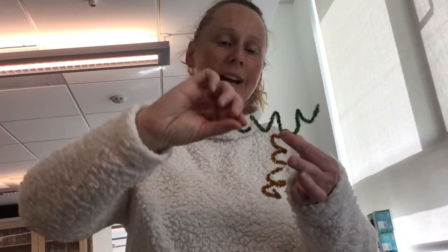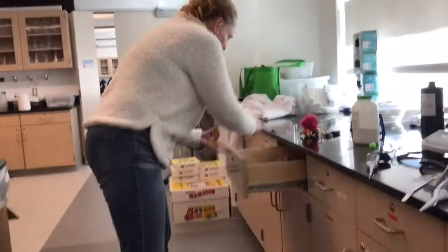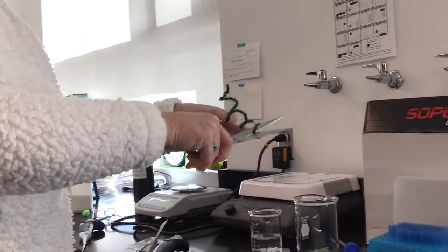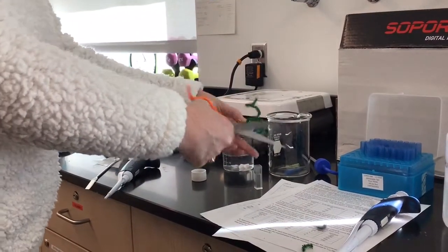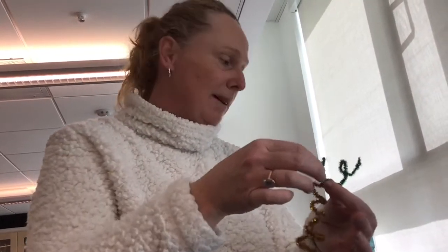So what we're going to be looking at hopefully is how amylase, the enzyme that my daughter has produced in her saliva, is going to start breaking up and breaking down this large structure into smaller structures of actually maltose. So again, if this is made up of millions of glucose molecules, what we're going to see is that the enzyme Zosha produced is going to very quickly start breaking this down into maltoses. And then the maltoses are later going to be cleaved down by maltase in the small intestine. As that happens, how are we going to detect that actually in this lab that we're doing today?